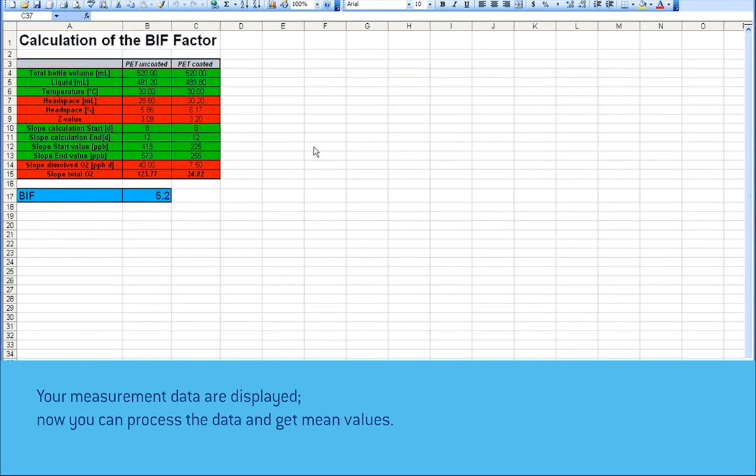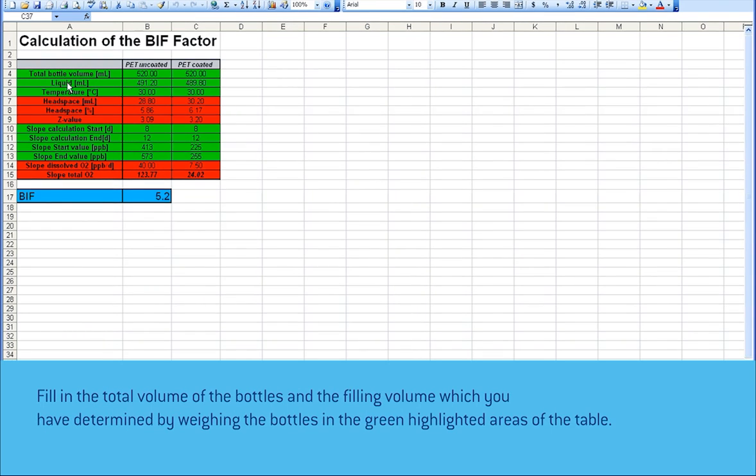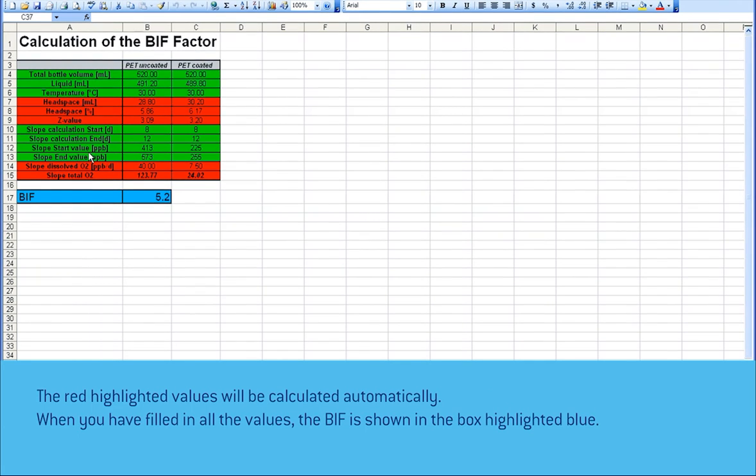In case two comparable bottles with different oxygen barrier layers are tested, the barrier improvement factor BIF can be calculated. Fill in the total volume of the bottles and the filling volume, which you have determined by weighing the bottles, in the green highlighted areas of the table. The red highlighted values will be calculated automatically. When you have filled in all the values, the BIF is shown in the box highlighted blue.